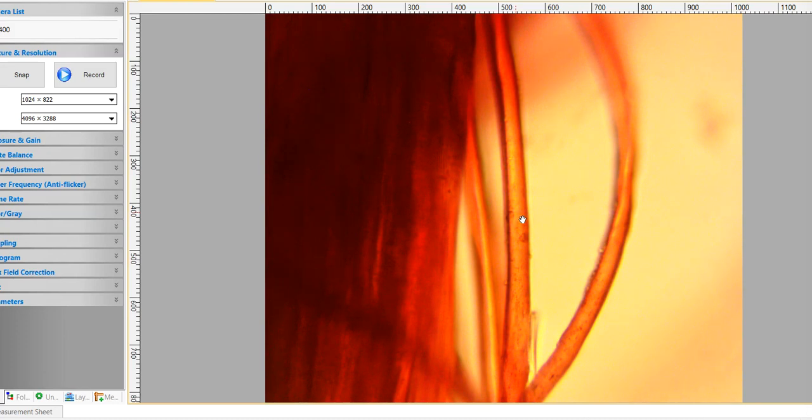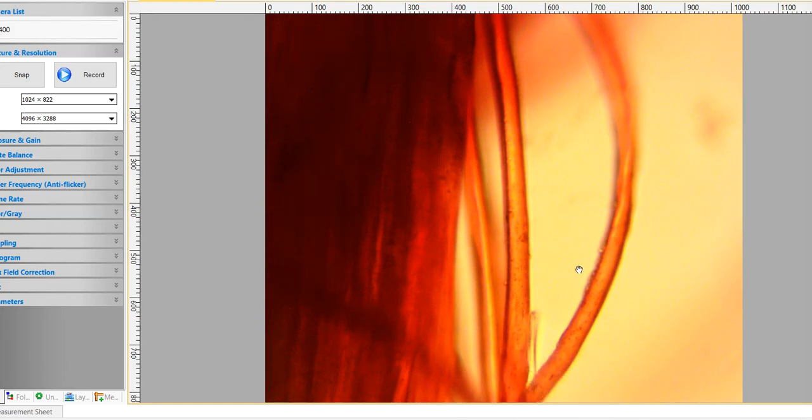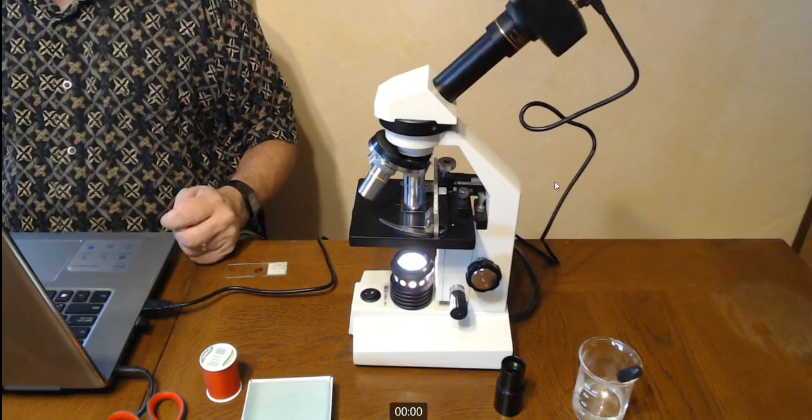So I'm going to now, here, let's go back to here. So we've looked at our slide. Generally what we'll do in classes, we'll look at the slides, we'll draw and label what we see. Now I won't grade you on your drawing skills, I will grade you on your labeling skills, so label what you see. So let's go back to our camera here, there we go.